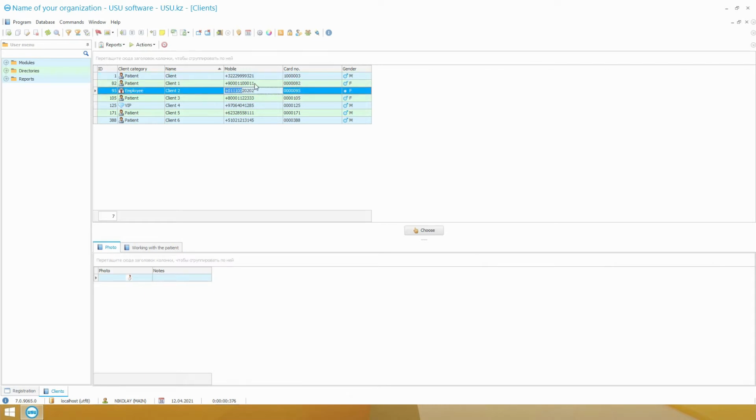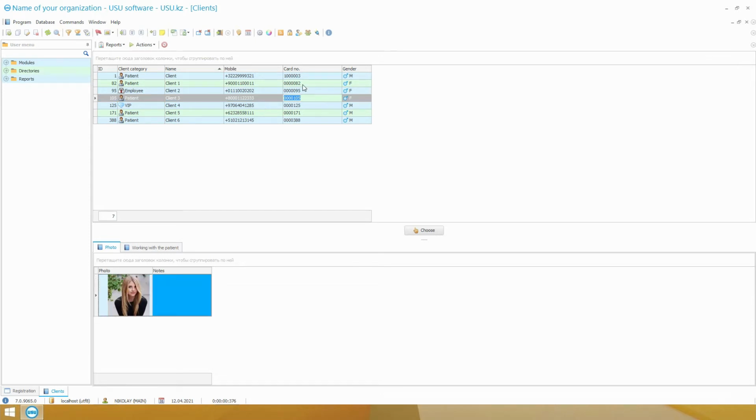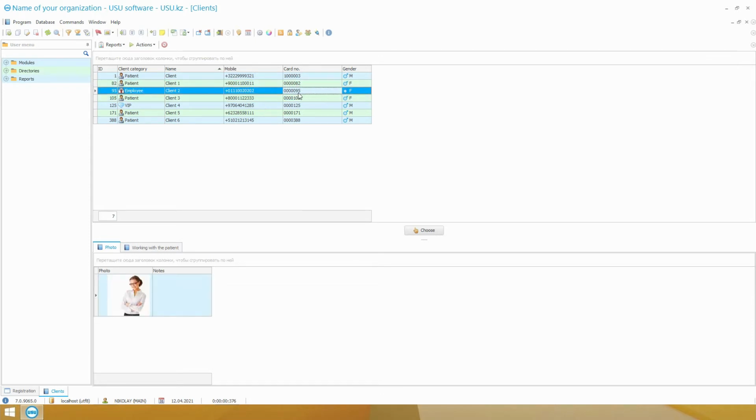When a patient is registered, he or she is immediately assigned a category according to gender and age, as this determines whether or not his or her test results will be within limits of normal range. If desired, it is even possible to save the client's photo in the database, which is taken with a webcam.